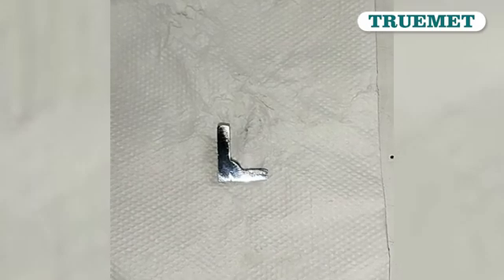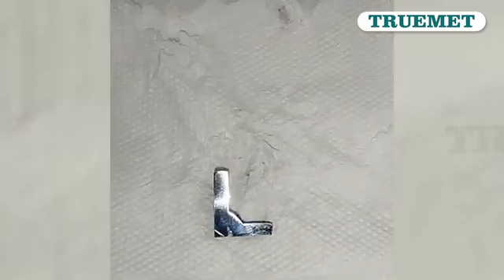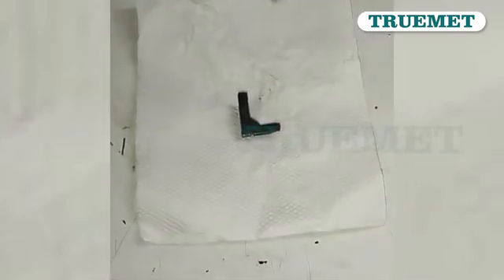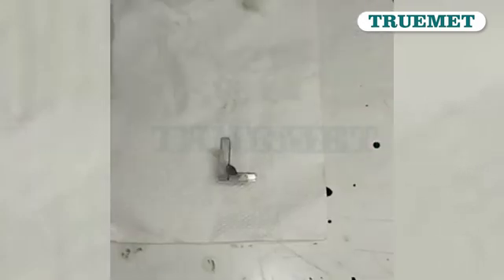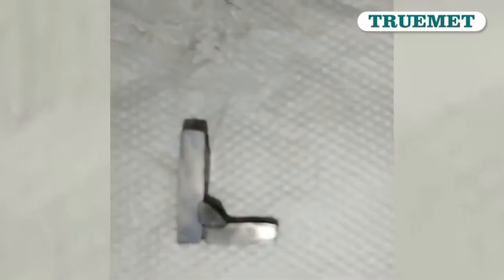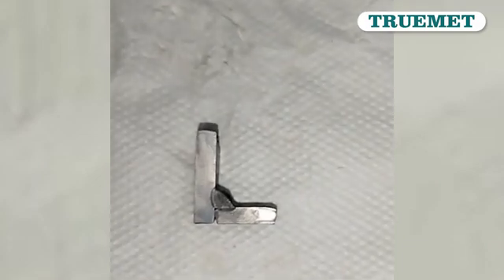So polishing of the component has been done. You can see this is our final product after polishing. Now we are moving to our third process, that is etching of the component. For etching we are using nitric 3%. So we are going to etch the component and show you what happened after etching. We etched the component using 3% nitric, and this is the final product.